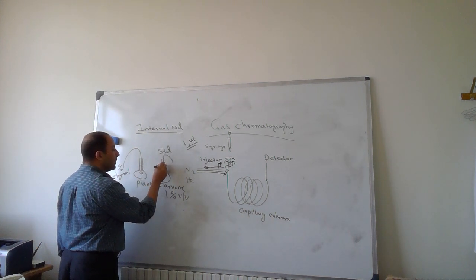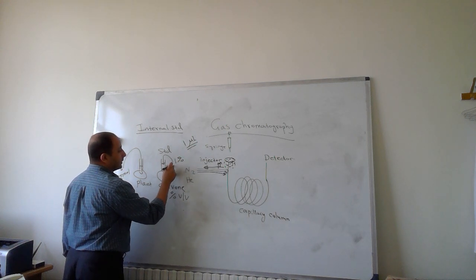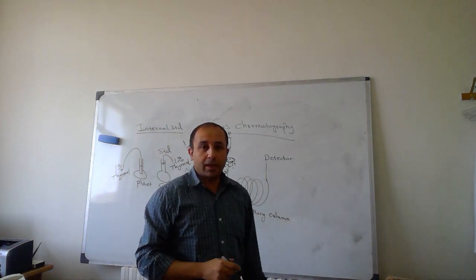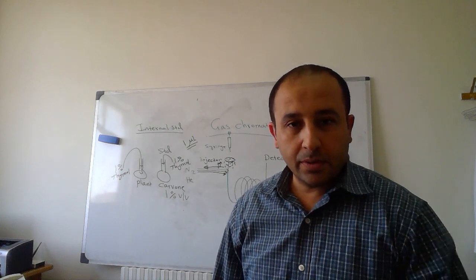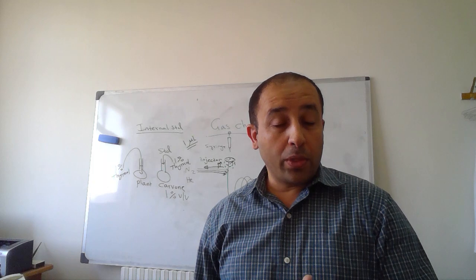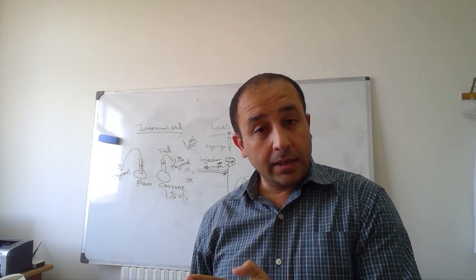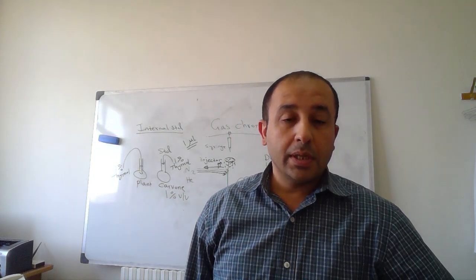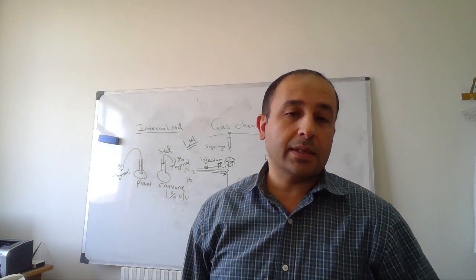The same thing, I will put exactly the same amount of thymol in the standard. So I will put also 1% of thymol in the standard container. So the same quantity will be there for the internal standard, in both the extract flask and also the external standard flask.